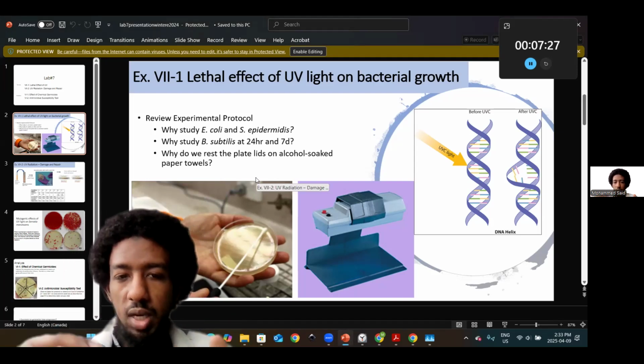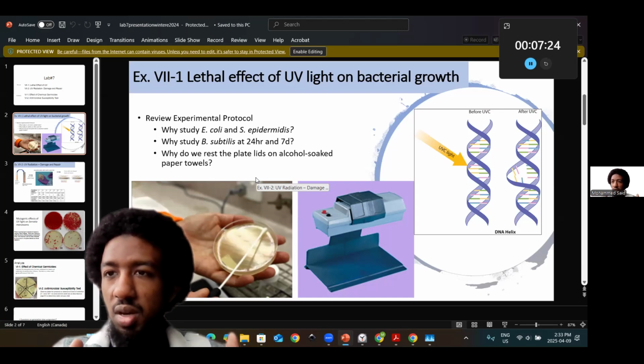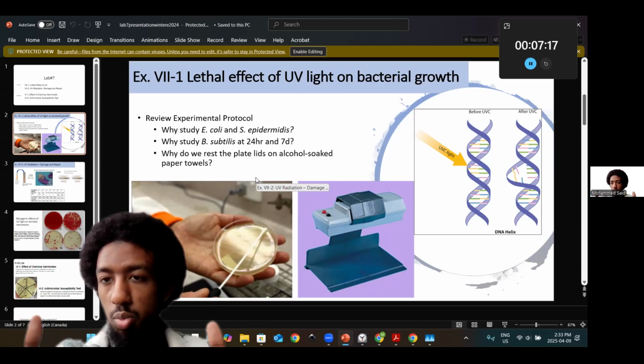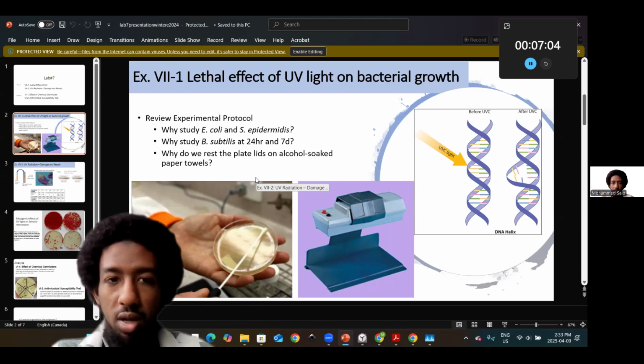If you had, because you would be opening up your plates of interest, it would be detrimental to have the lid opened up with exposure either on the bench top or to the airborne environment, right? Which is why I was also concerned about it in this regard, right in front of you. But nonetheless, that's one of the rationales.